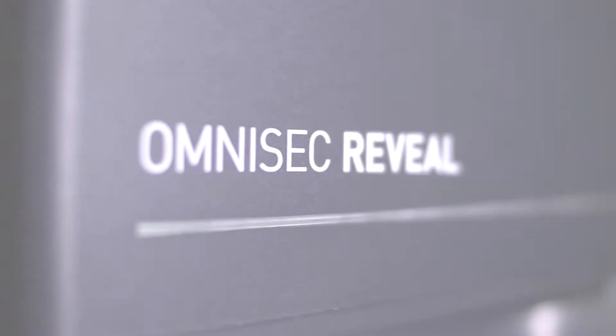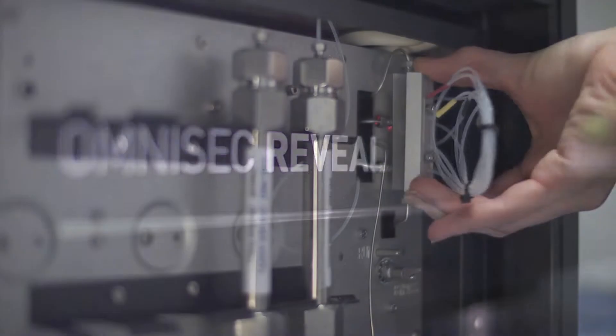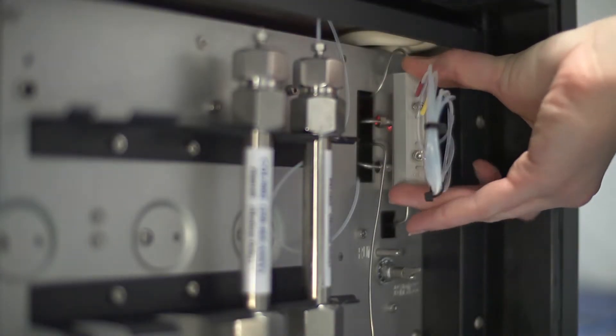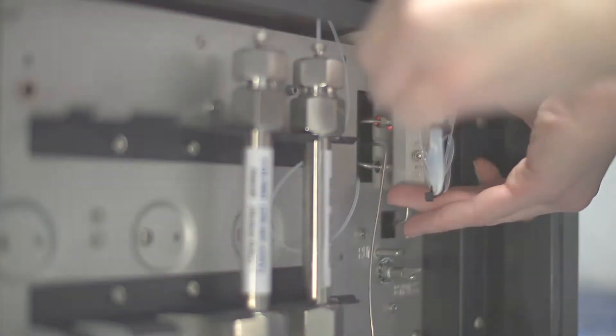And then in the second module, OmniSec Reveal, we've got the integrated detectors, so the detectors all integrated together into a single unit.